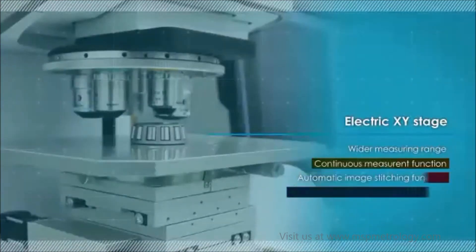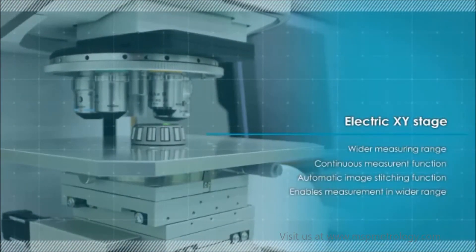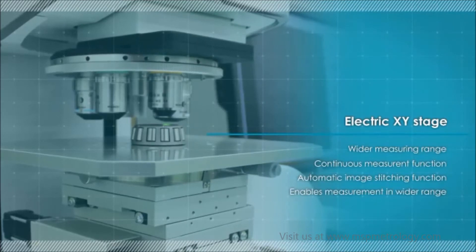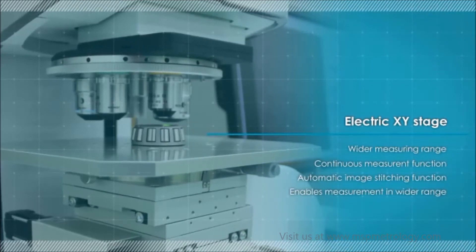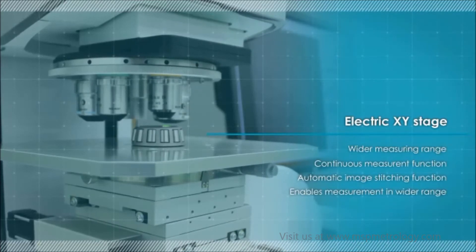An electric XY stage guarantees a wide measurement range. Using either the 25mm or 50mm electric stage, continuous measurements at multiple locations in any sequence can be conducted.